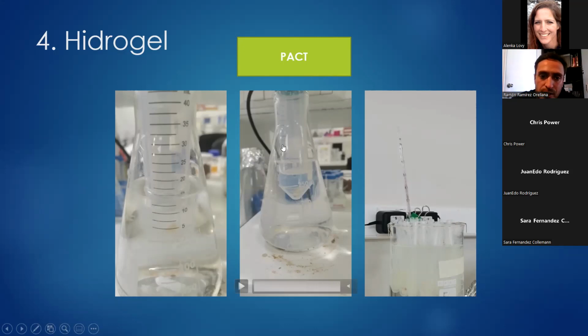Esto es para muestras grandes, y para muestras más pequeñas las ponemos en un sistema de pipetas Pasteur, donde ponemos dentro la muestra, que si son, por ejemplo, un nervio ciático, o tejidos más pequeños, con el mismo sistema de recirculación. Y lo más importante es siempre ir monitoreando la temperatura y el pH.